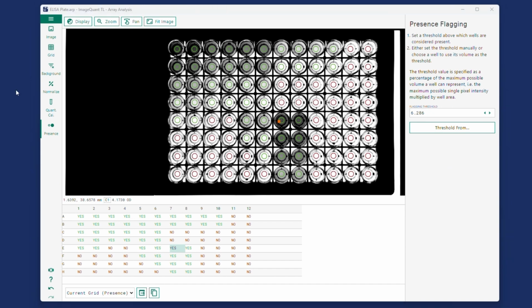This concludes this video. Number crunch complete and the results look neat.